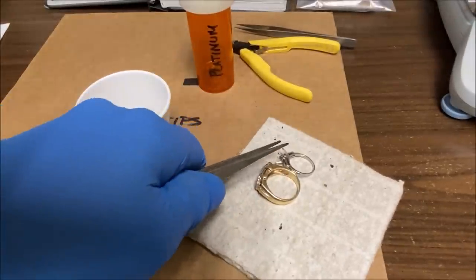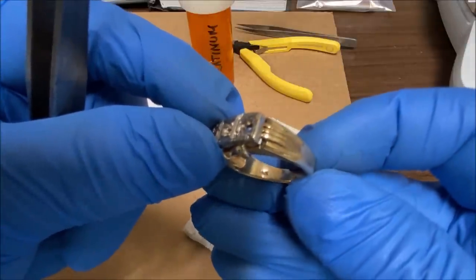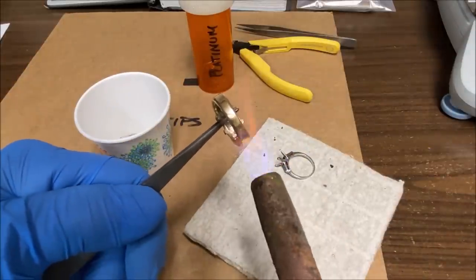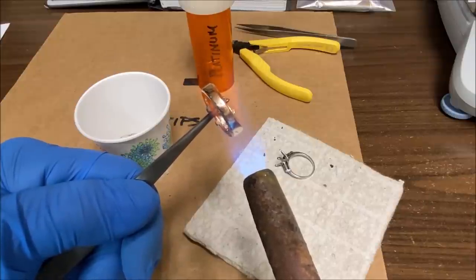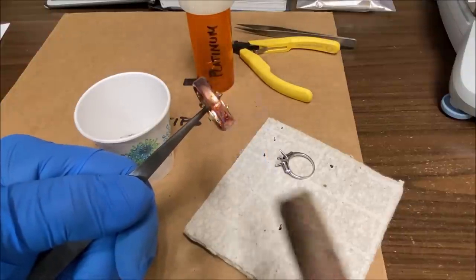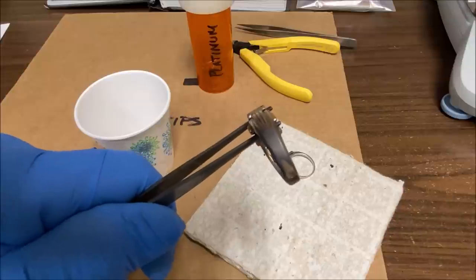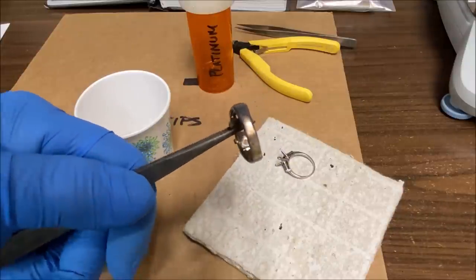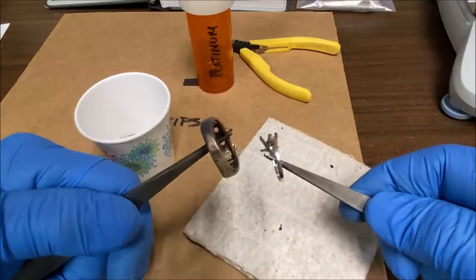For contrast, I have a 14K ring here. It's got a mark down in there. It says 14K. And we'll do the same thing with the gold ring. Just put a flame on it, heat it to redness. We almost melted it, but you can tell the difference. The metal becomes discolored, and that's what the difference is between gold, silver, and other metals, and platinum.